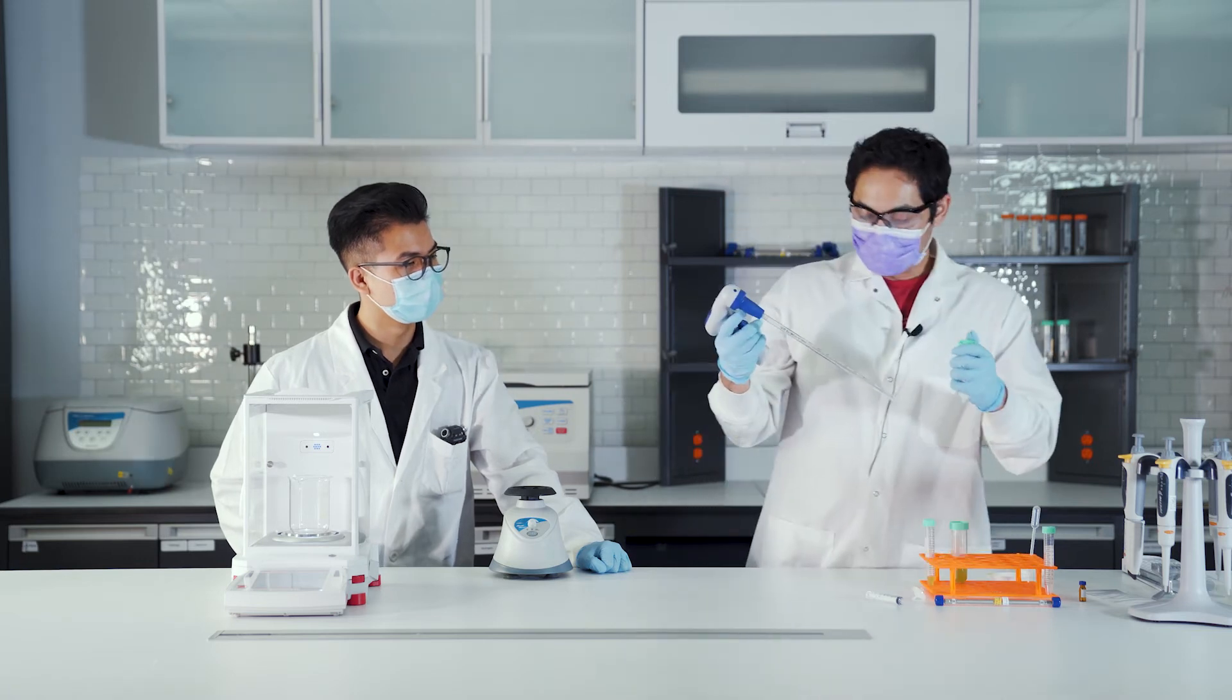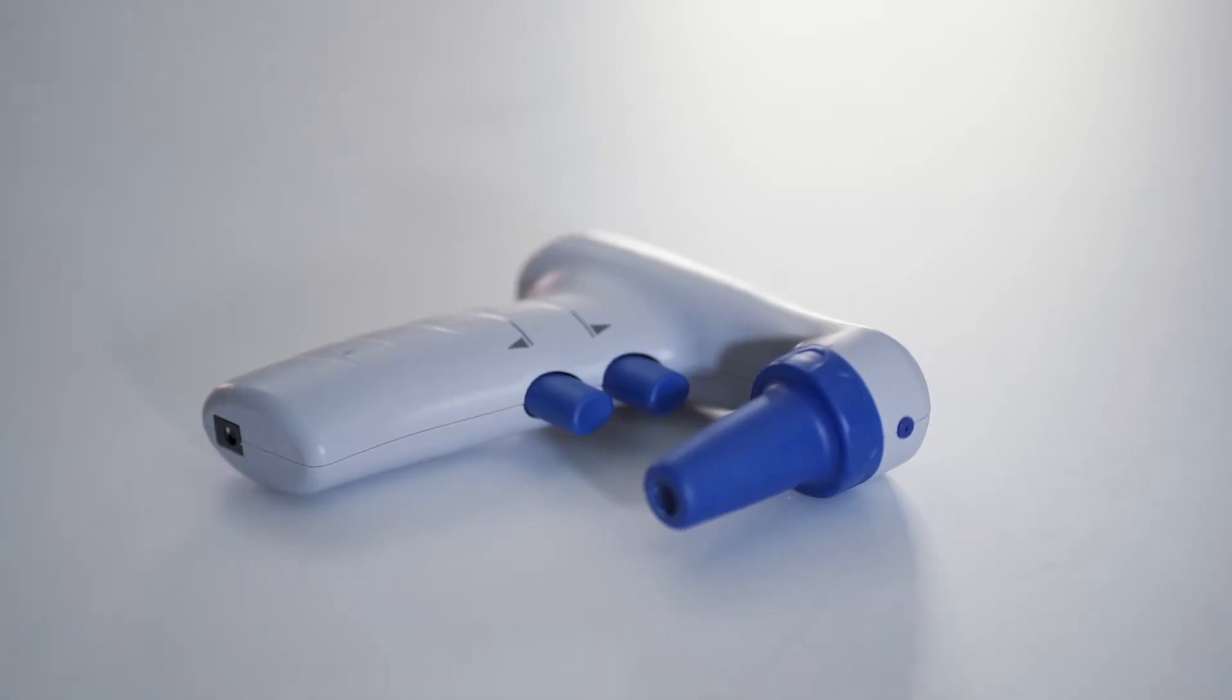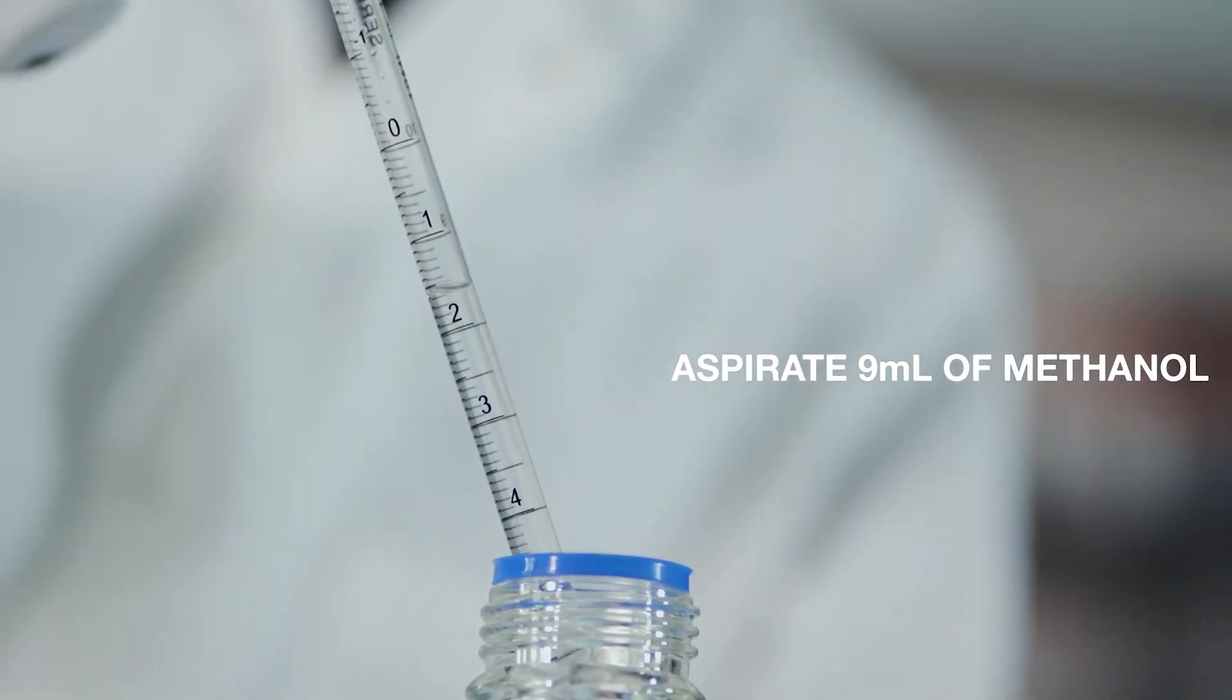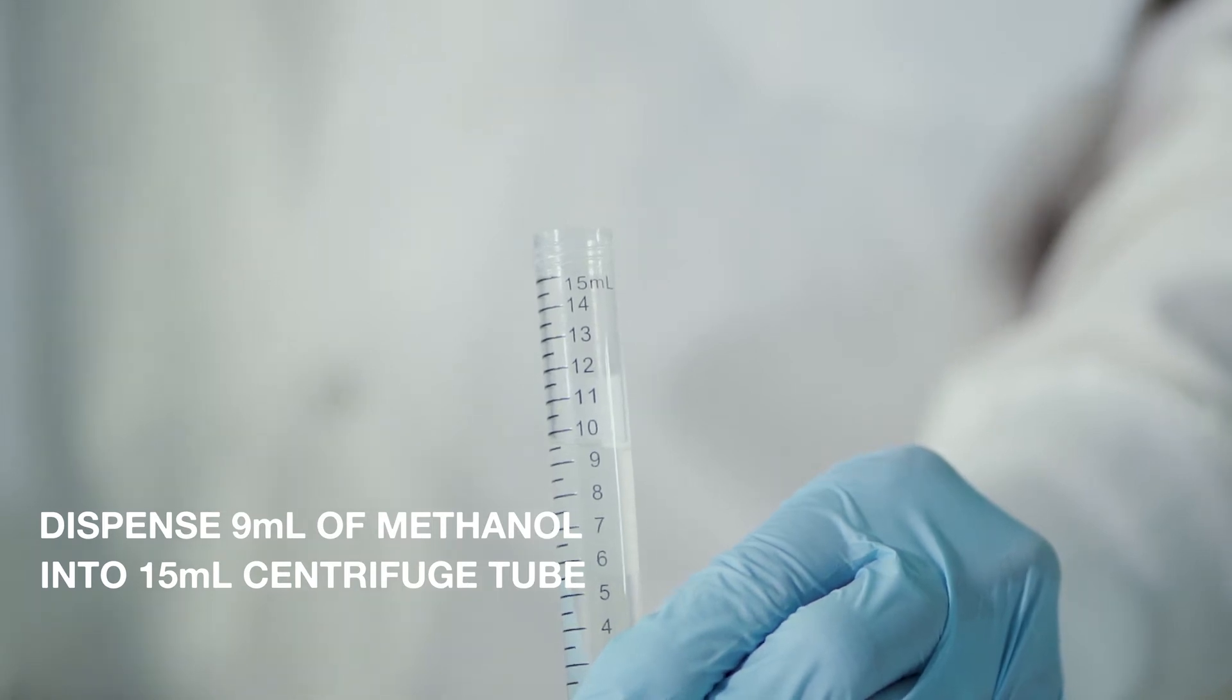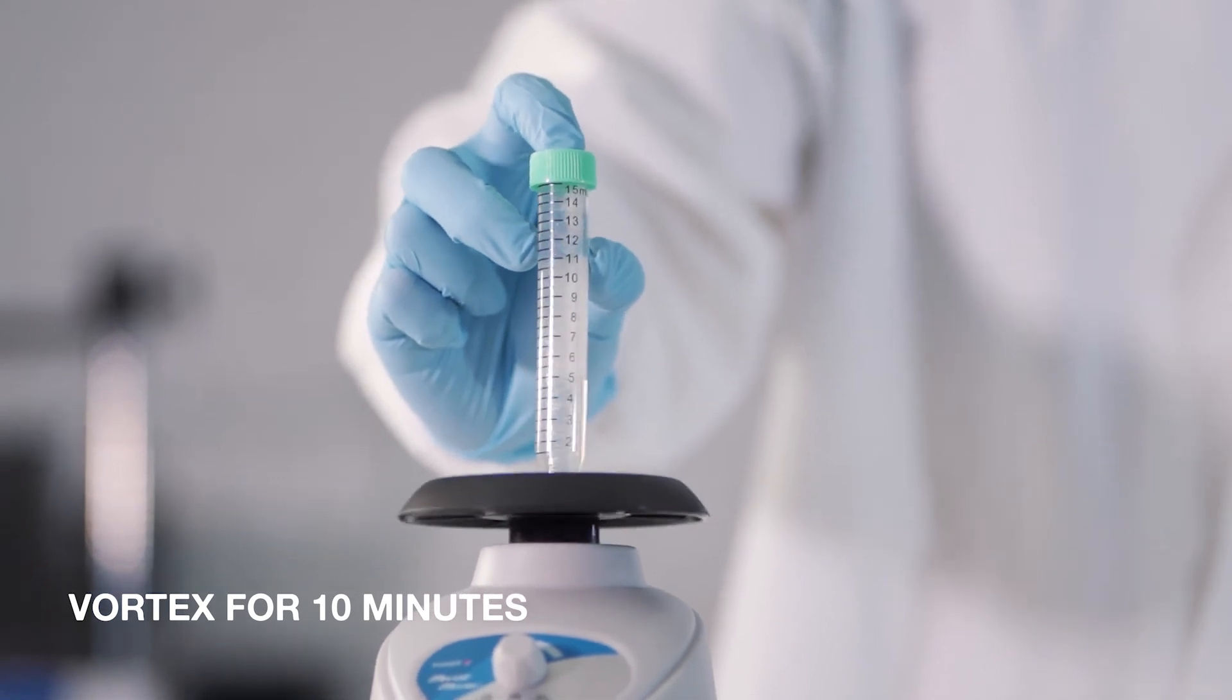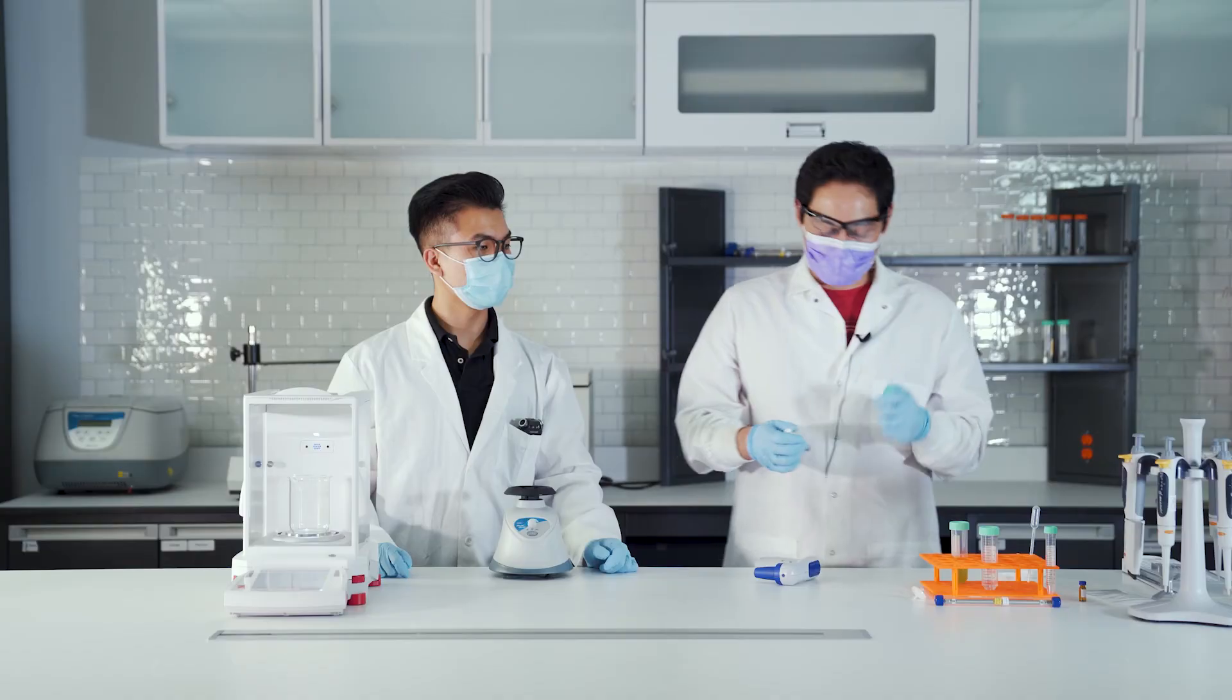This is a 10 mil pipette, so let's get this up to nine. That's about nine. So that's roughly 10 mils in there, and then we want to vortex and spin that down as well. Go ahead and vortex that. After you vortex that, you want to go ahead and get that into this centrifuge, and make sure to balance it with another.